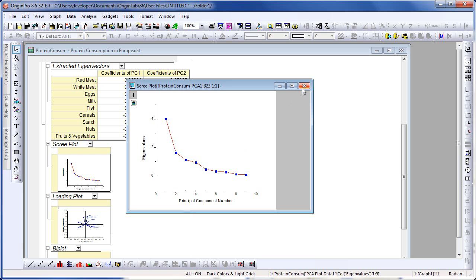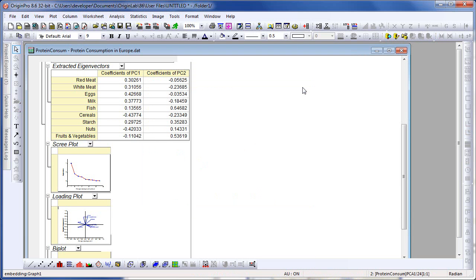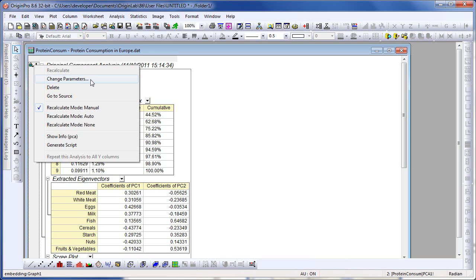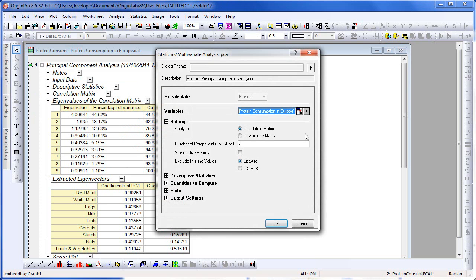Let's go ahead and close this window and return it to its parked location in the worksheet. I'm going to reopen the dialog and update my analysis results. I scroll up, left click on the green lock, and choose Change Parameters, which will reopen the PCA Statistics Analysis dialog. We're going to modify the number of components to extract, changing this to four.